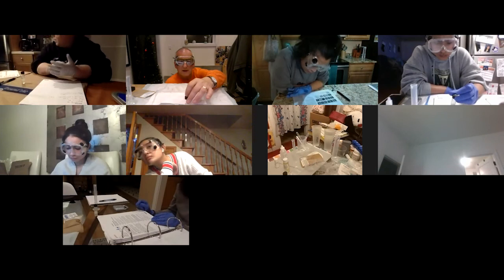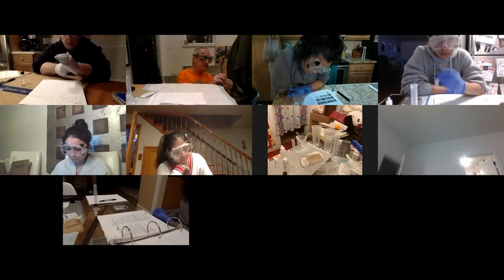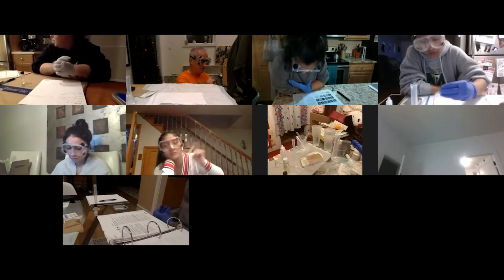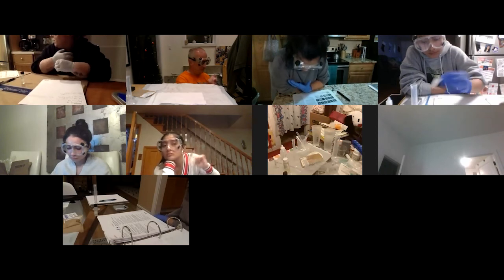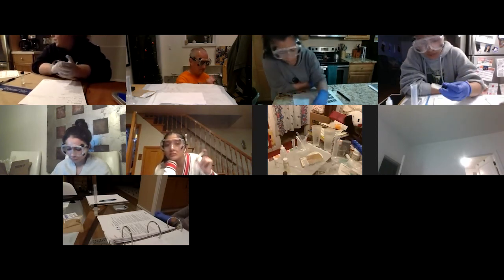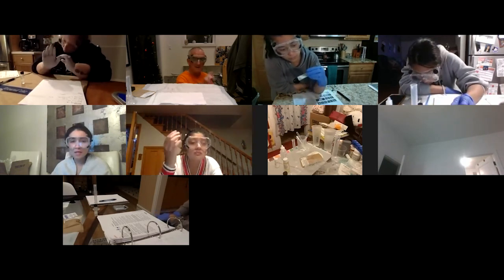All right, I'm going to shake mine up again. You don't need to wait 10 minutes? I think it was 5 to 10, wasn't it? It said allow the mixture to stand for 10 minutes, then shake it again. Oh, I thought it was 5 to 10. Oops. You're not reading the instructions like what you always tell us to do. No, I did read the instructions.